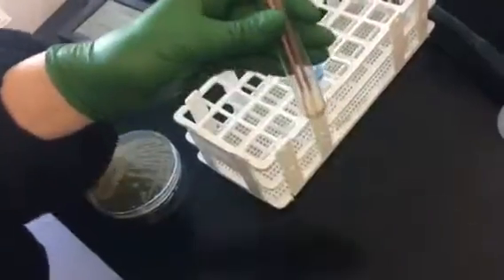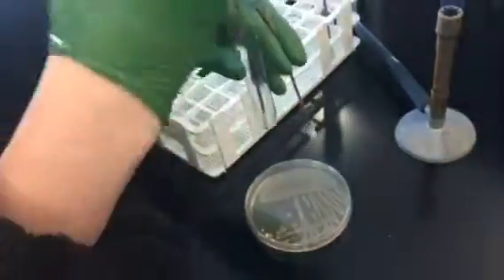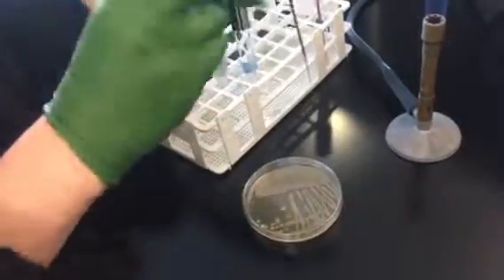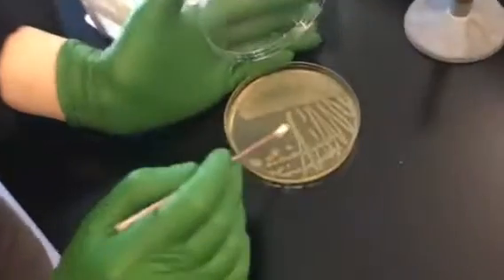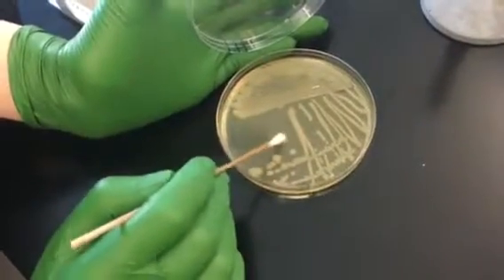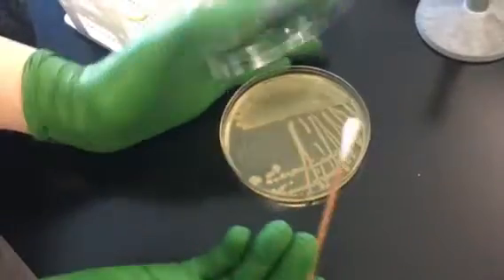Next, take a sterile swab that's dry and remove some of the bacteria from your streak plate — the plate that contains the bacteria you're going to be testing. You're going to pick up about one to two colonies' worth. You might need to pick up more if you have small colonies, but these are fairly large.